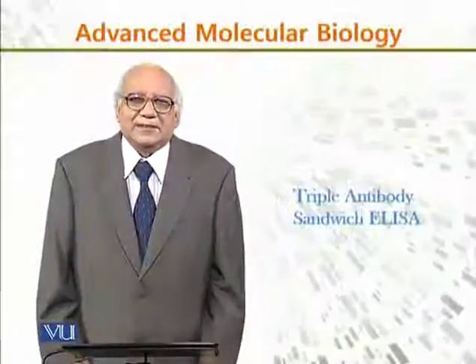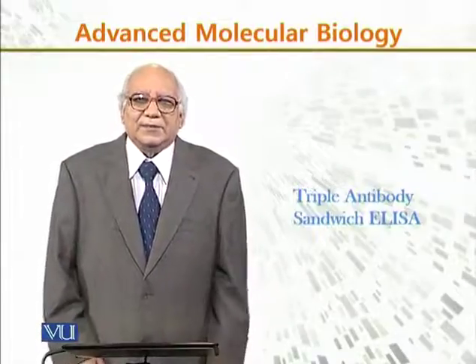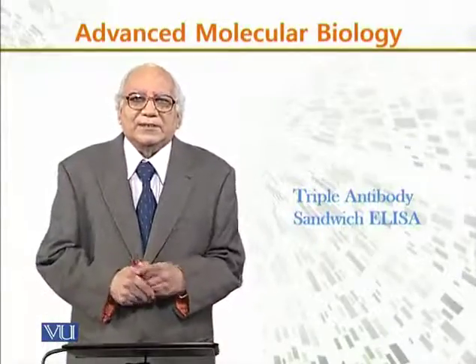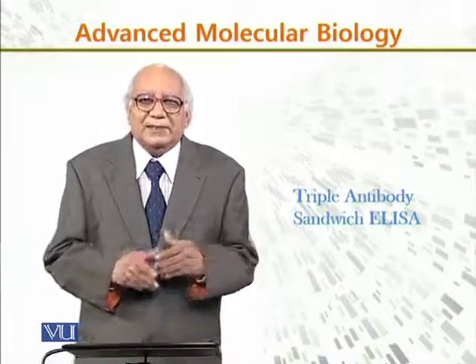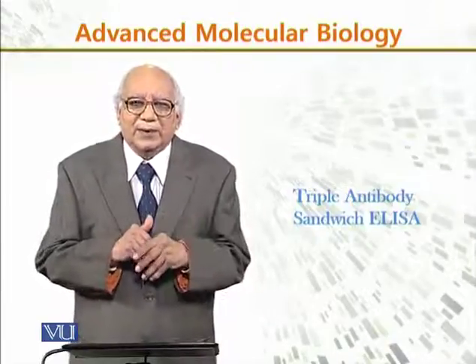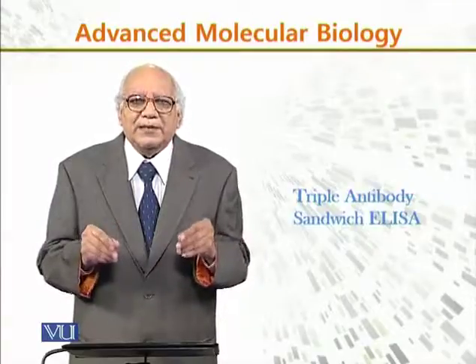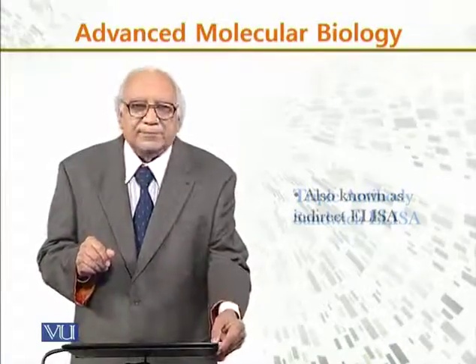Many methods for assaying the antibodies. And in the previous modules, we have discussed a number of them. Now today, in this segment, I will discuss another interesting method to assay the antibody, and that is known as the triple antibody sandwich ELISA method.